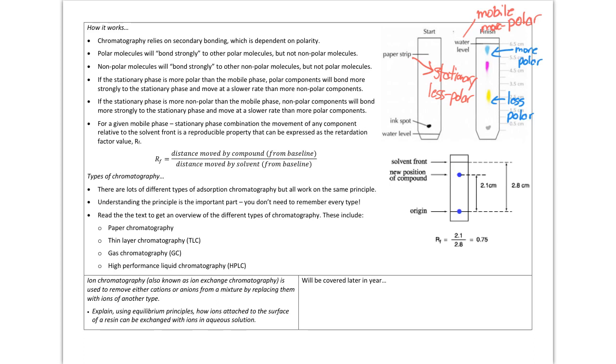You can also get column chromatography, which is a bit like liquid chromatography, where you have a column, like a burette that we used previously.